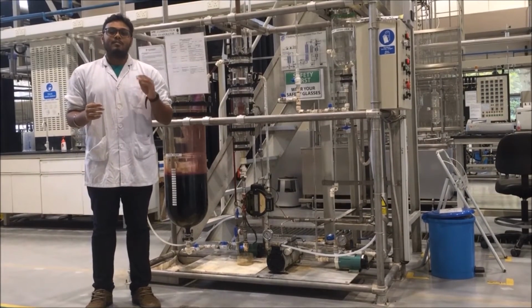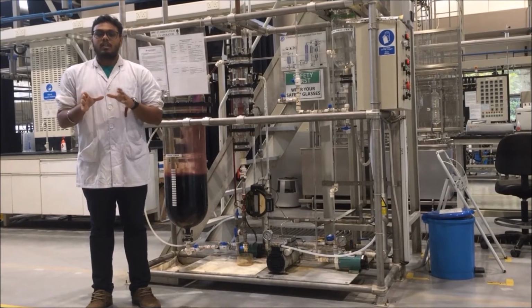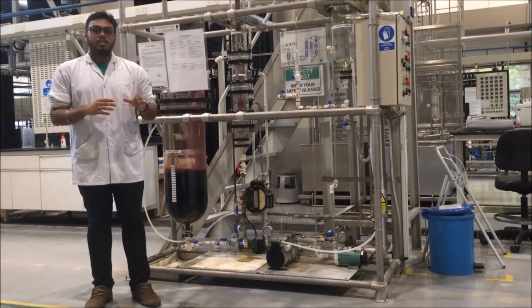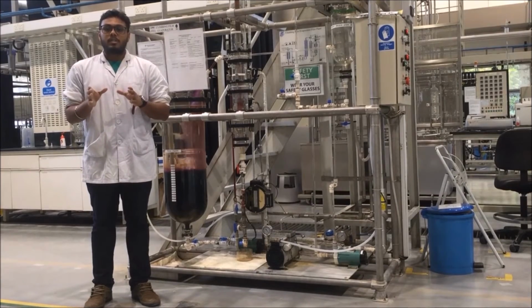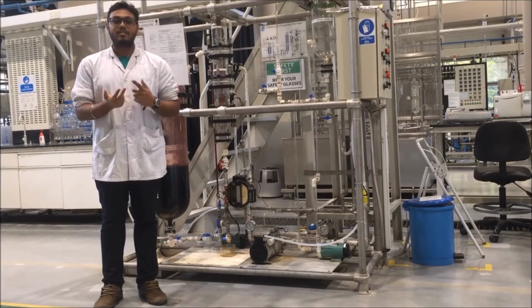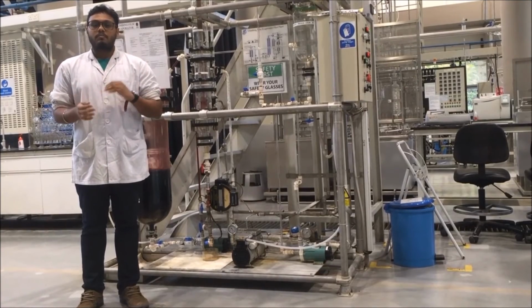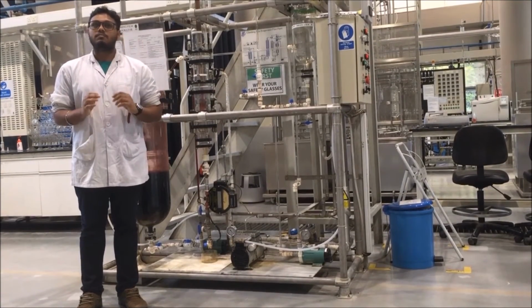In experiment part 2, we are required to maintain a stable pressure as preferred. To do this, one has to always observe the pressure gauge and toggle the on and off button to maintain the pressure at the required condition. After collecting the samples of the evaporate, concentrate and condensate, we have to measure the volume. While measuring the volume, we have to keep our eye level at the meniscus line of the cylinder.